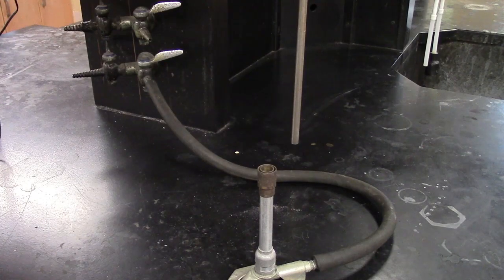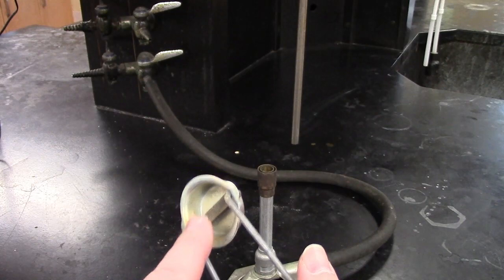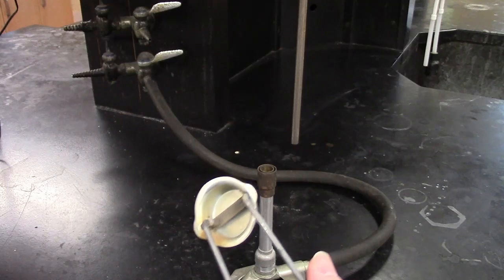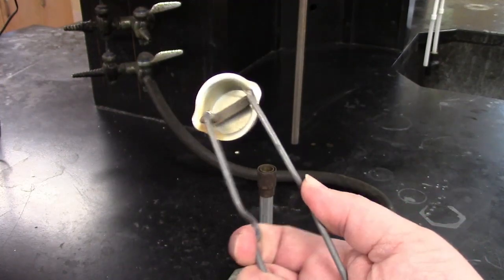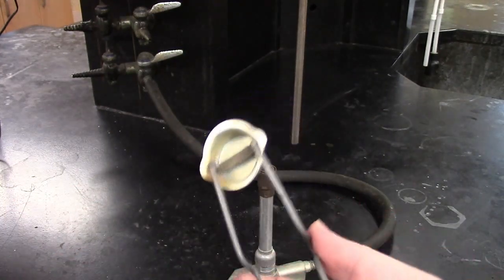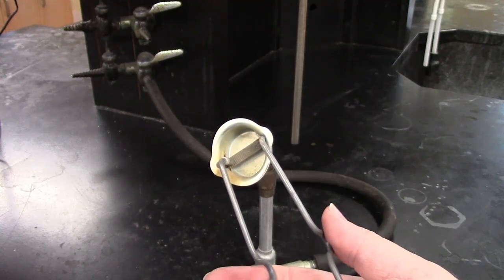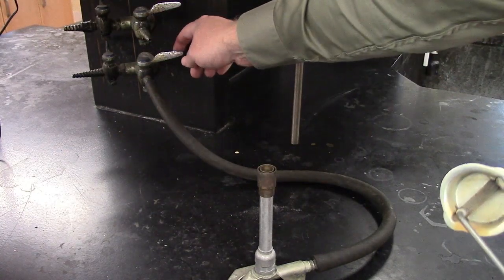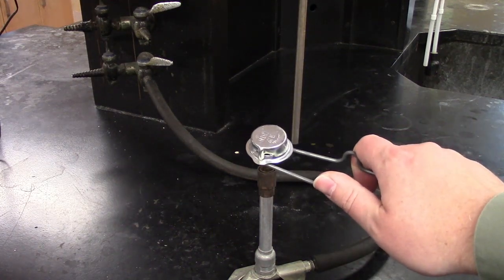So let's learn about how to use the Bunsen burner. We have a striker, and with this striker we have a piece of flint that is going to be scraped against a piece of steel. And if I push just sideways, just this direction, then I don't get very many sparks. But if I push in and sideways at the same time, I get many more sparks. So we want to push at sort of a 45-degree angle using that handle. So let's turn on the gas, and then use the striker to light the Bunsen burner.